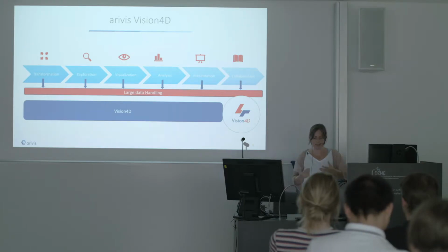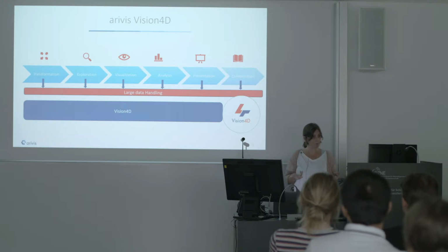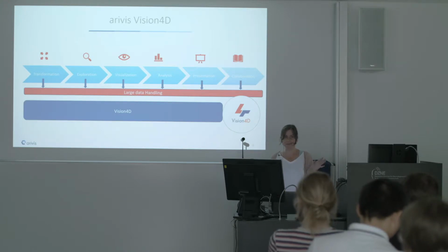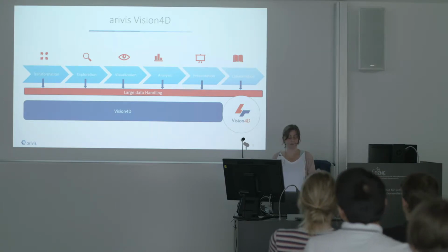And you would really always be able to get a preview of what you do. And that is important, because if you have 500 gigabytes of data, you are setting up a pipeline, or you're setting up an animated movie, and you start to run, it runs overnight or is finished the next day, and you find out, not so nice, I have to redo it. That's a pure waste of time.